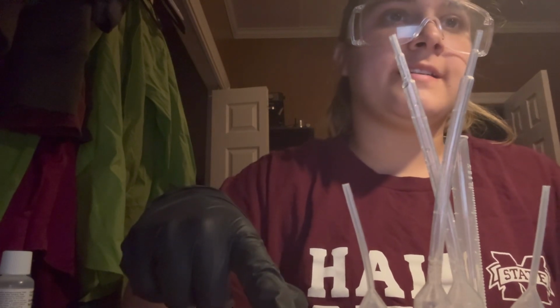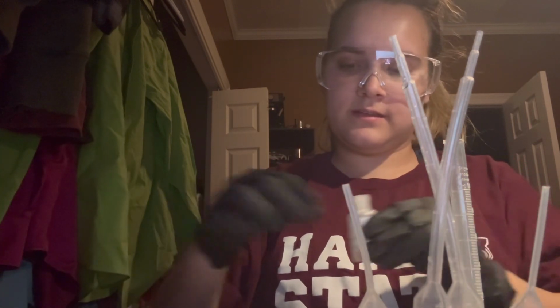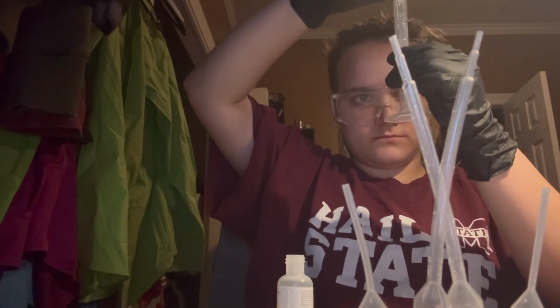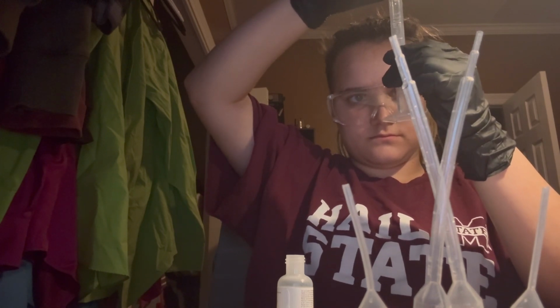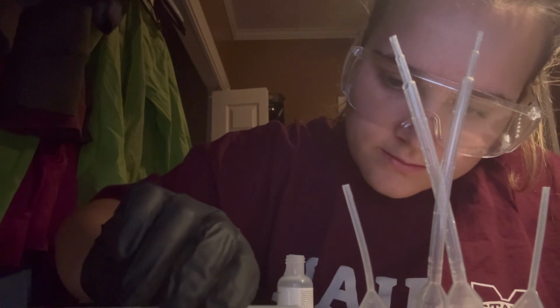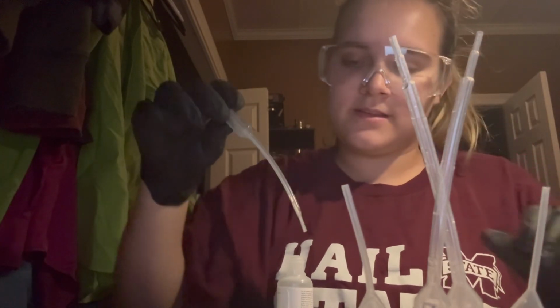Now we'll be measuring 2 milliliters of distilled water into D6, but this time we'll be adding 1 drop of 6 molar NaOH into the well. I have my NaOH right here, and my NaOH pipette, and my distilled water right here. So you can measure 2 milliliters of this. This will go into the D6 well. Then we will do 1 drop of this NaOH.